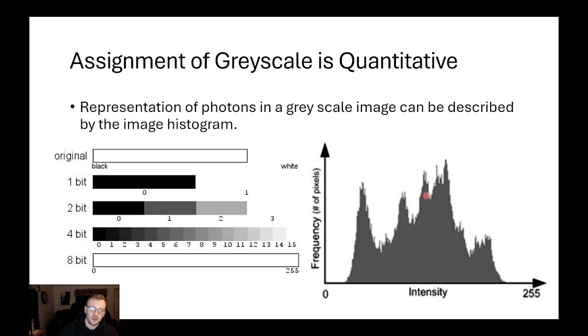Where over here, using that same idea, maybe we had the same 100 proteins, but they were distributed across a 12 micron area. So 2 photodiodes were recording the current from those 100 proteins. So we had a weaker current generated from the photodiode, which means it's a dimmer gray value. And because of these relative brightness, relative intensities, we can then quantify the number of proteins, the brightness, the localization of our proteins in our image that we've generated.